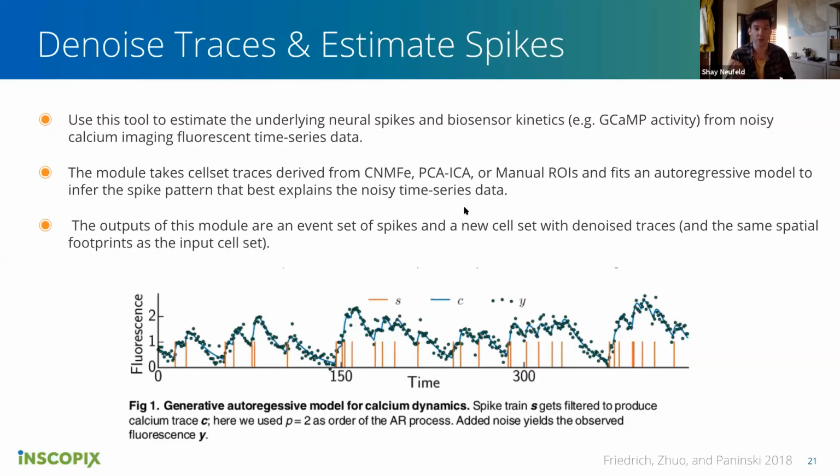contains the denoised traces, which is basically the spikes convolved with the time kinetics that it estimated that the calcium buffer had from the data. Okay.